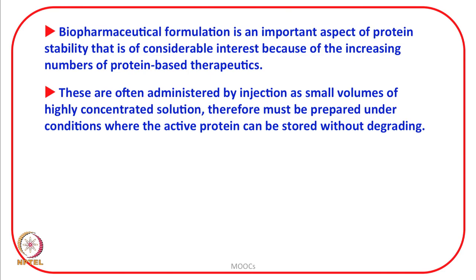Let us emphasize this sentence, where the active protein can be stored without degrading. So, how can we check whether the protein has degraded or not? How can we check whether the protein has undergone some denaturation? Differential scanning calorimetry provides an immediate answer to it.